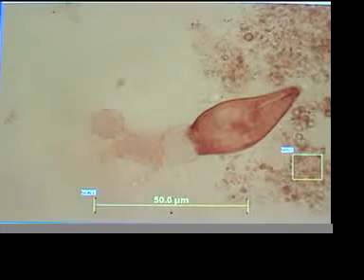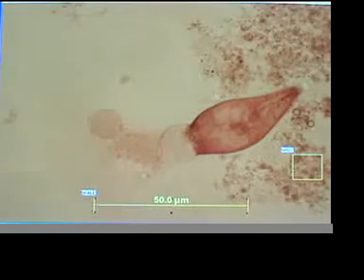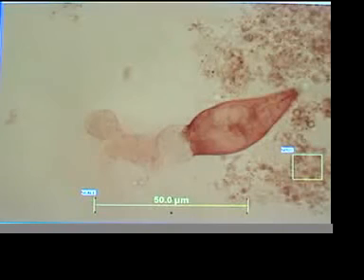Oh, it looks like the cilia action stopped. Nope, there's a little activity there still. It's hard to see. Trying to focus. The size is continuing to change. Very slow and subtle. Maybe that's all we're going to see from this guy. I'm just watching another organism up above in the microscope slide who has a very interesting shape.